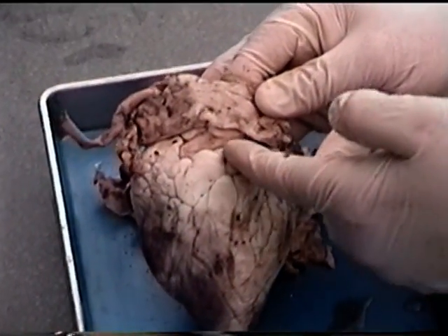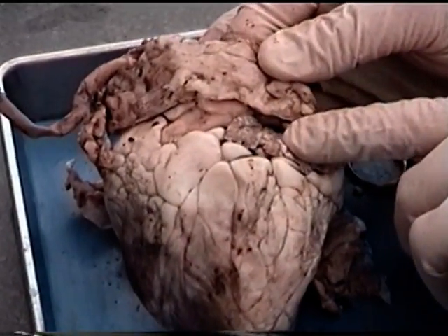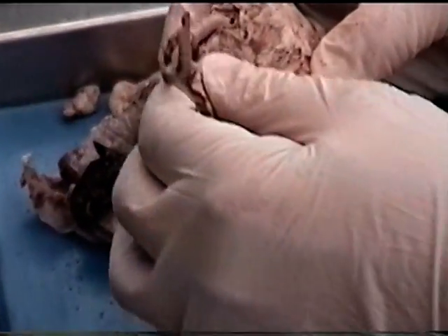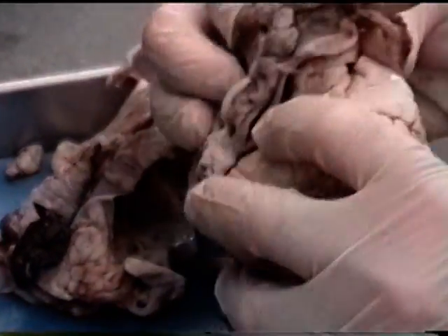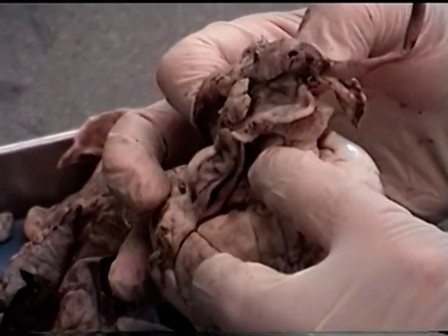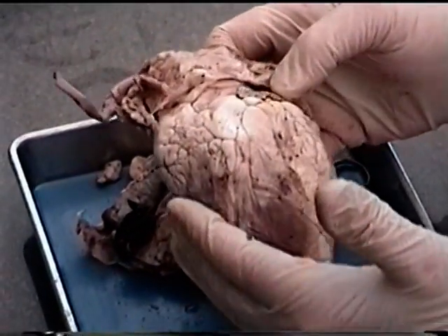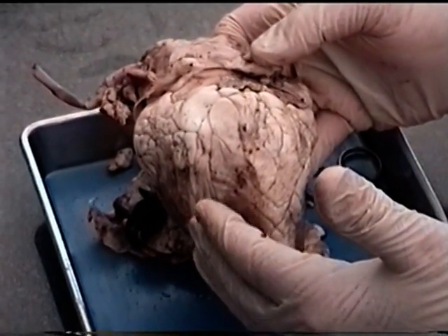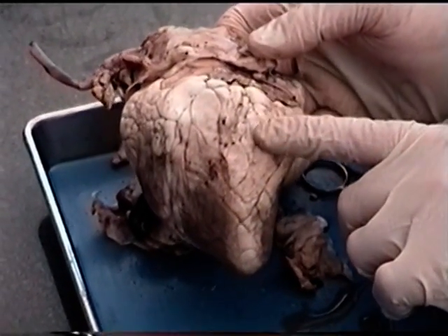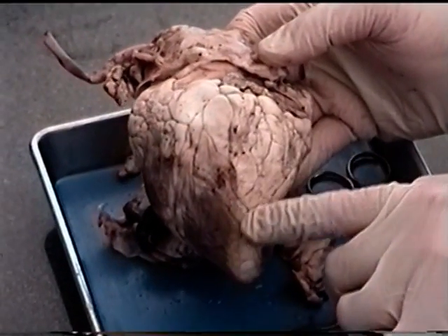This is an auricle, and so this would be the auricle of the left atrium on the left side. And we go over here and we should be able to see another auricle right here, which is the auricle of the right atrium on this side. So since we know this is right ventricle, left ventricle, then where all this fat exists is on that interventricular sulcus.